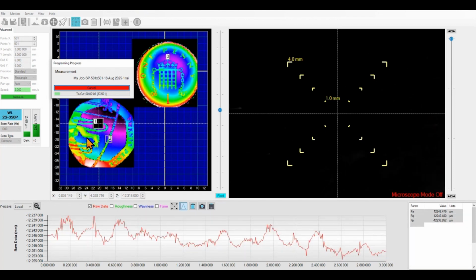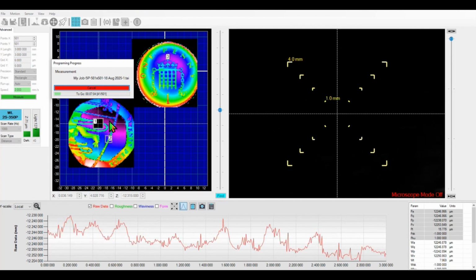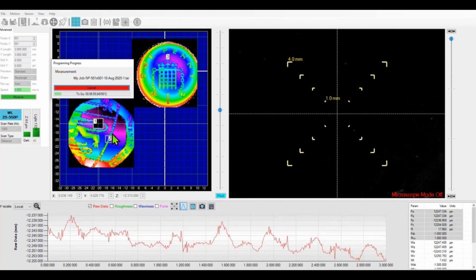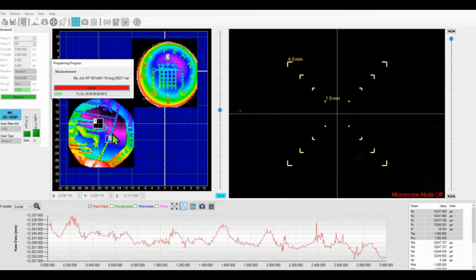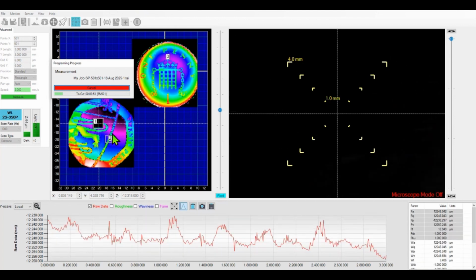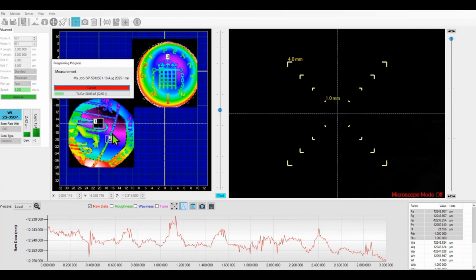It's an automated program. So the 3 measurements here will probably take about 10 minutes to combine, but I can now walk away from the instrument, go and get myself a cup of coffee. Once the 3 measurements are completed, there'll be a noise which will alert me to the fact that the measurements have been completed. Or if I were to leave the room and go off to a meeting, it will send me an email to tell me that the measurements have been completed.